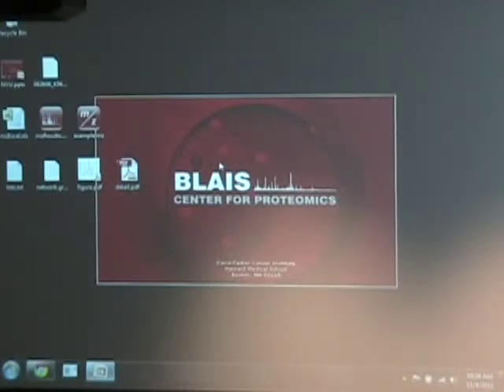And it allows very basic capability in terms of information about the data, which is basically, here's the experiment and publication this is associated with, and here's the raw data. But it doesn't do much more than that, and it certainly doesn't allow you to interactively browse the data. But there are people working on this. It's still jello on some level. I don't want to give the impression that there's nothing.